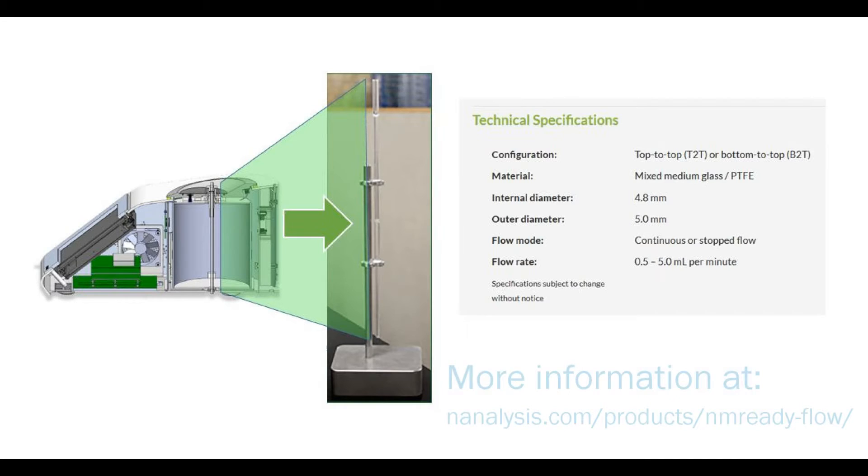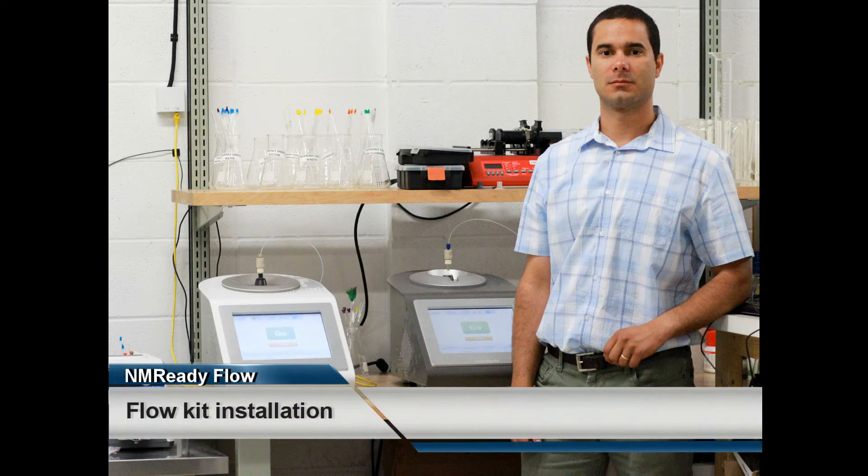Let's now go through the 10-step installation procedure. We show you how to install this on an NMR-Ready 60E, but it's the exact same process for the NMR-Ready 60E Pro. I'd like to introduce you to Dr. Juan Aranata, who will be performing the installation.